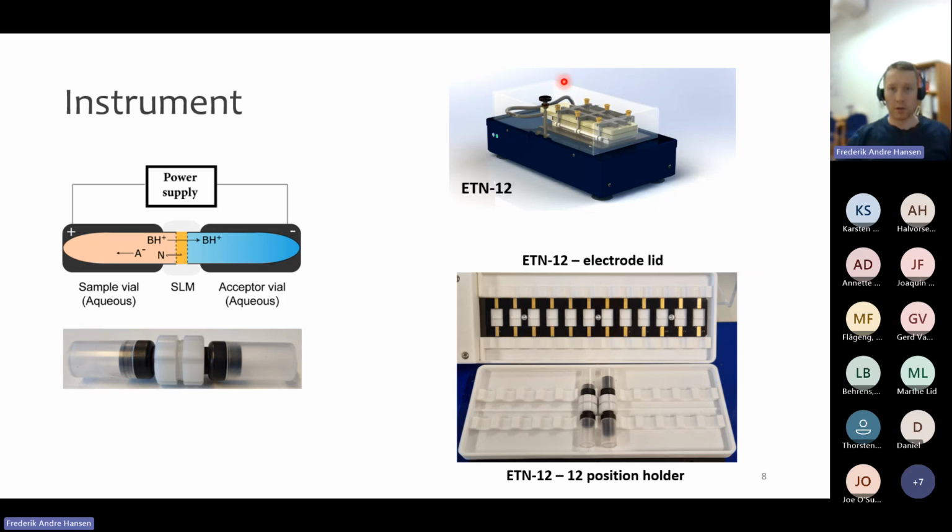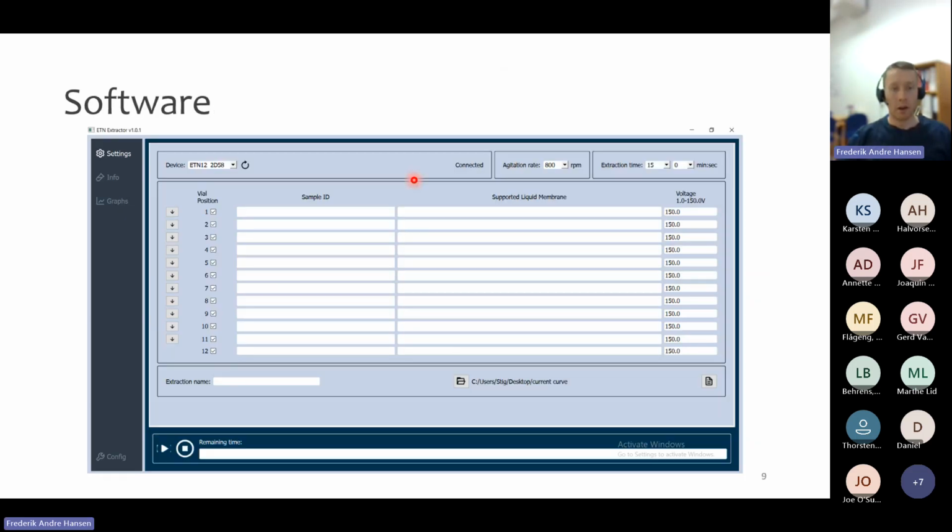The whole instrument is seen here, which has a quite small footprint, so it doesn't take up a lot of space in the lab. The parameters of the instrument are controlled by software using a PC connected to it. We will not go too much into detail with this software. That might be the subject of a future webinar.